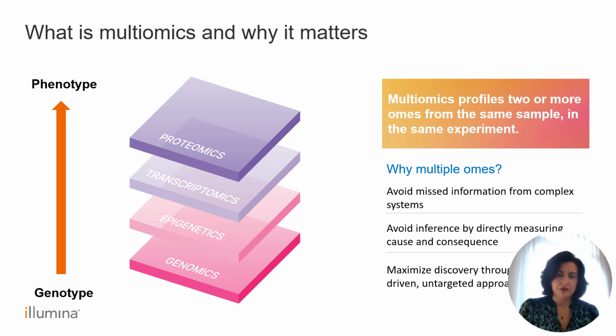So why would you do multiomic analysis in liquid biopsy? Obviously, by doing multiomic analysis, you can measure causes and consequences, and you can explore genotypes and how they translate into phenotypes and function. So by doing so, you can maximize discovery of your experiment and you can get more insights.